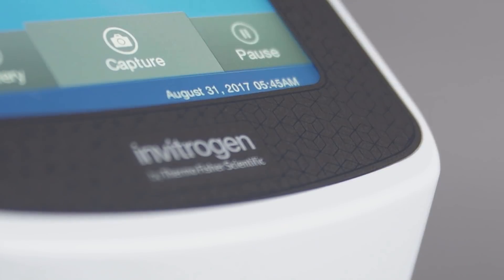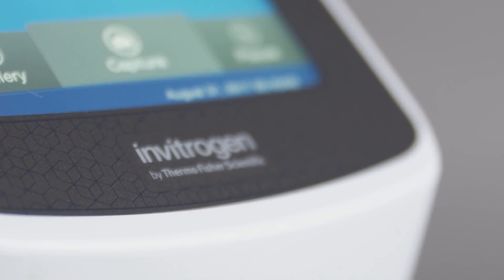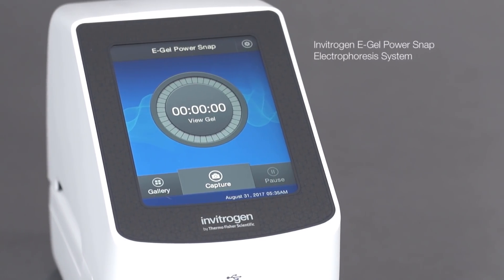In this video, we will show you how to simplify agarose gel electrophoresis and analysis using the Invitrogen eGel PowerSnap electrophoresis system.